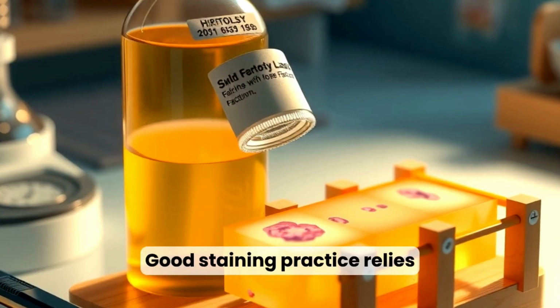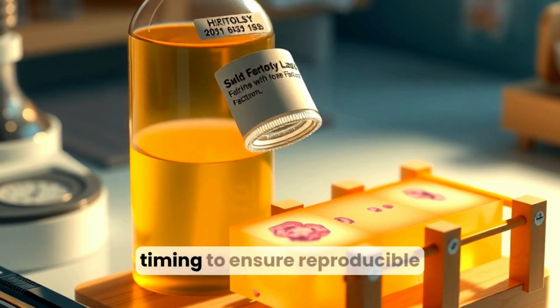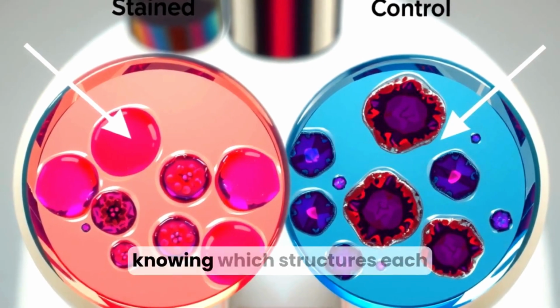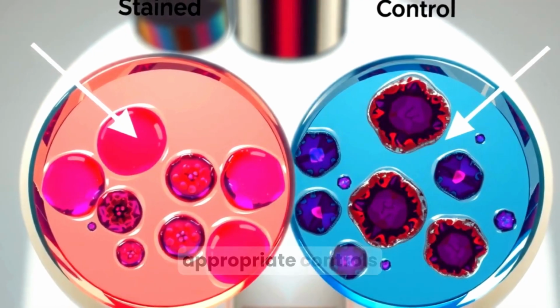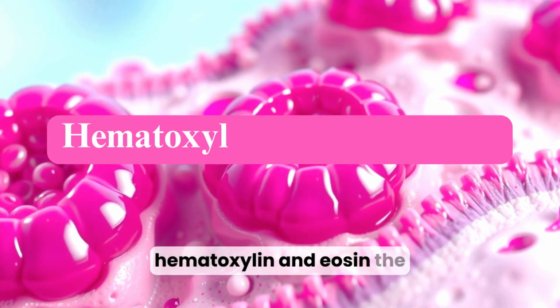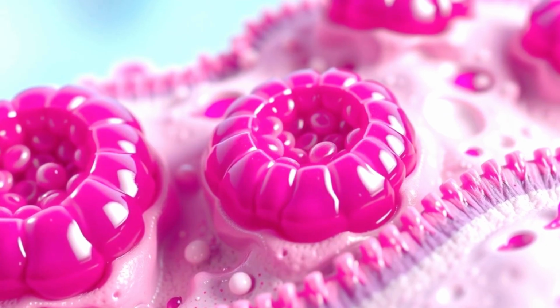Good staining practice relies on consistent fixation, proper sectioning, and controlled timing to ensure reproducible color development and minimal artifacts. Interpretation depends on knowing which structures each stain highlights and on comparing stain fields with appropriate controls. We will now examine individual methods, starting with hematoxylin and eosin, the routine foundation for morphology and pathology assessment.